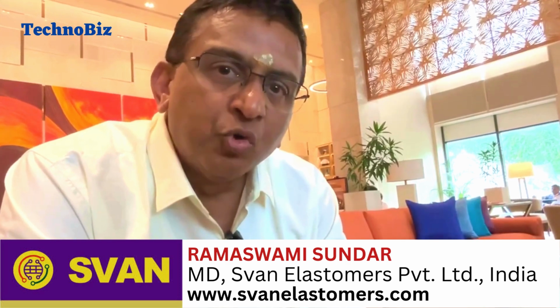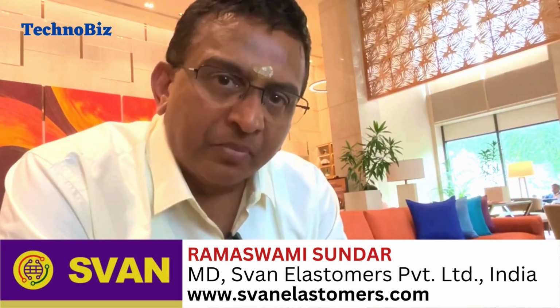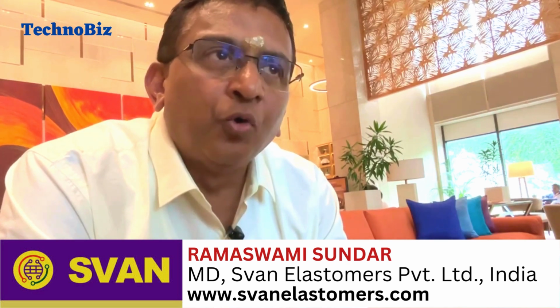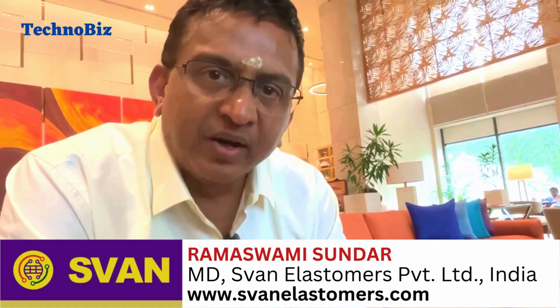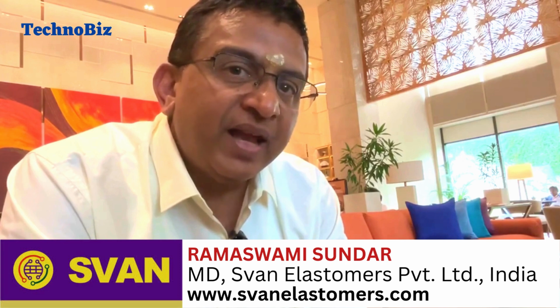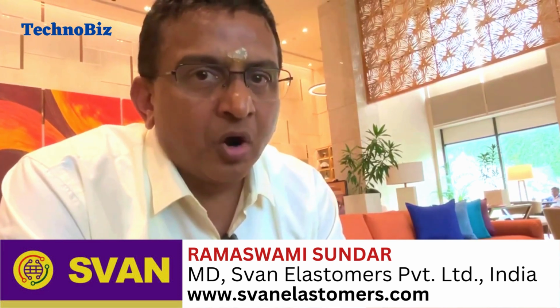So friends, whoever is involved in the lab, whoever wants to know about rheology, there is a whole new way of looking at the rheometer, and you can look at the rheometer to see the entire aspect of rubber compounds.